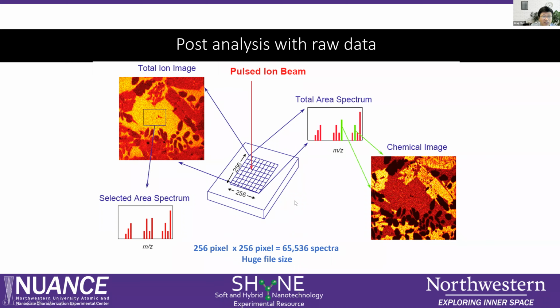For SIMS, you may collect data in just one hour, and the processing may take ten hours longer. But that is good, because you use another software, another computer, to do the data processing, and it does not charge you instrument time. Basically you collect everything. Even if during the collection you forgot to pick any peak, it doesn't matter, you have everything.